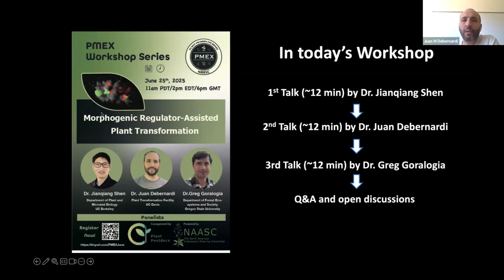I think the answer depends a lot on the crop. For example, in our case in wheat and barley, the explant, the immature embryo, makes a little bit of callus, but immediately produces somatic embryos. So there is no long phase of callus induction, which I don't like, because having the material in callus induction for a long time can also induce a lot of somaclonal variation.